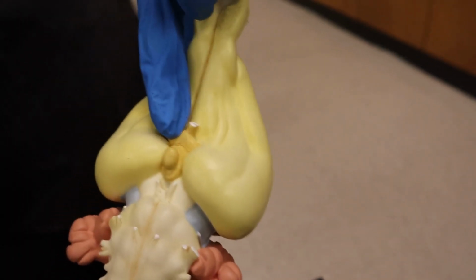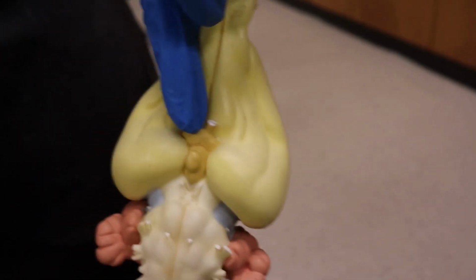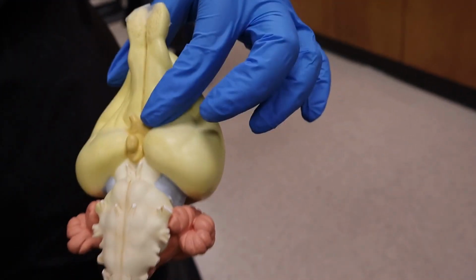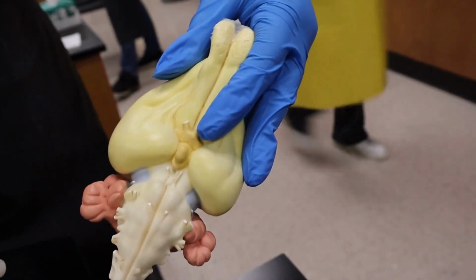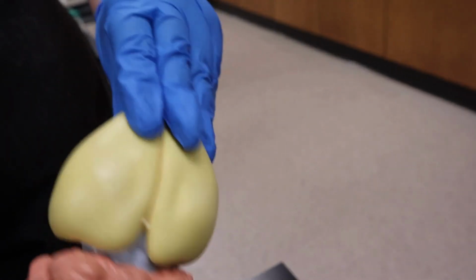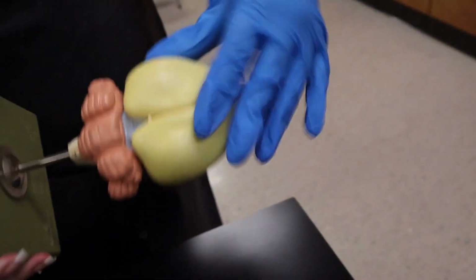Alright, so we have the darker yellow color, which is going to be our diencephalon, or the forebrain part. So this is going to help control adaptations related to the animal knowing what's going on in its body, like hunger, body temperature, thirst, as well as its biological clocks. And so then the lighter yellow right here, the main part of the brain, is going to be the cerebrum. This is the forebrain part.